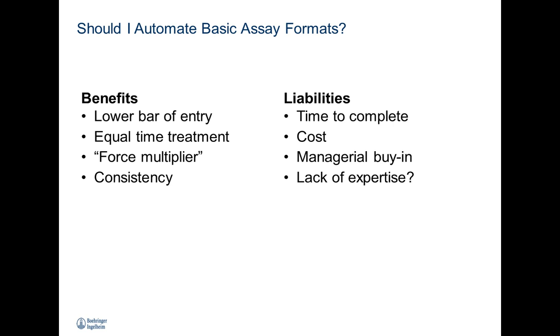If you use a liquid handler, whether it's something like a multi-drop dispenser or a multi-channel liquid handler, setting up the same protocol and running the same method is going to be handled exactly the same way every time. Some of the liabilities when it comes to automating some of these types of assays is automation generally is not faster. It takes a little longer to complete the same task than it would doing it manually.